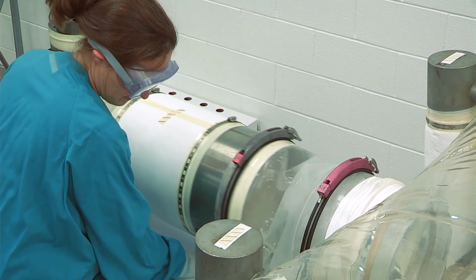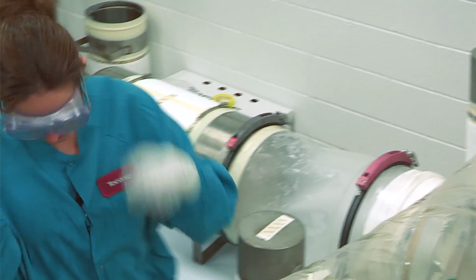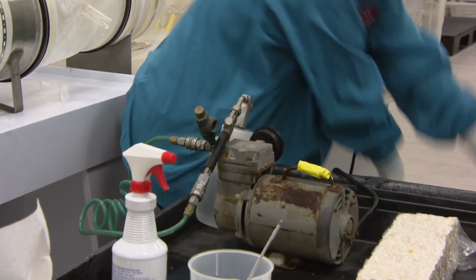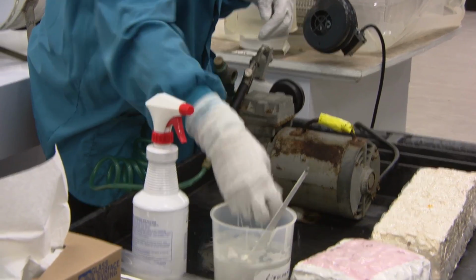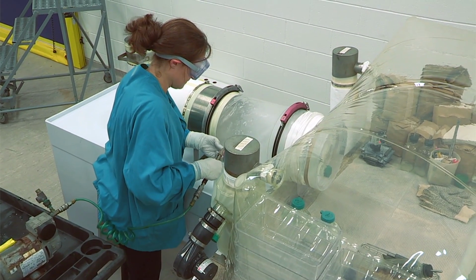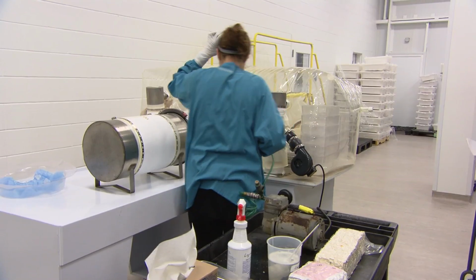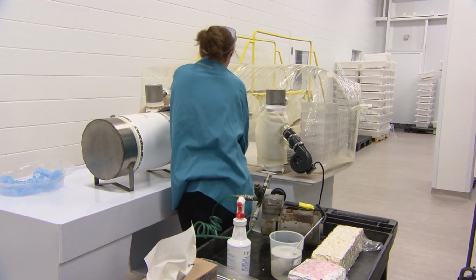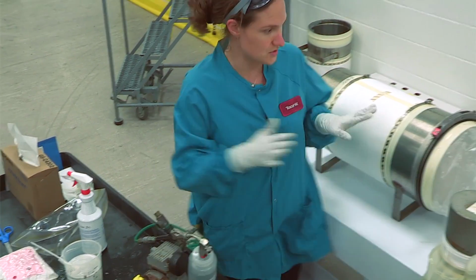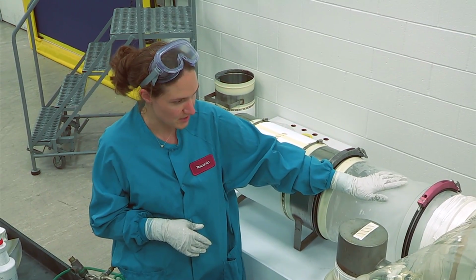Now we move up our cart so it's flush with our isolator. Pull this back. Now we're ready to use our atomizer. It creates a nice fine mist, and it also is creating pressure within the sleeve. And because we're dealing with so much plastic and the mylar on the cylinder, we're going to know if we have a hole, because this is nice and filled with pressure.